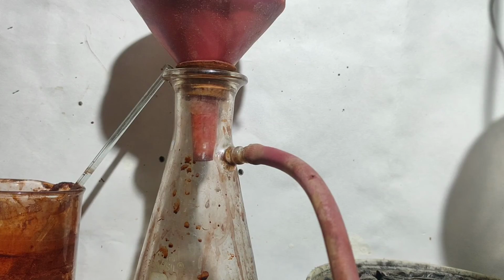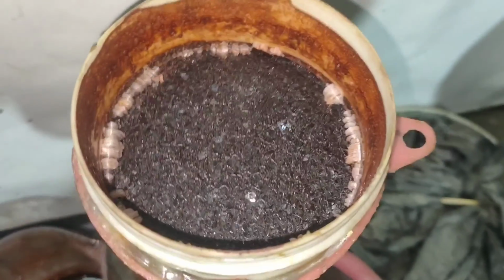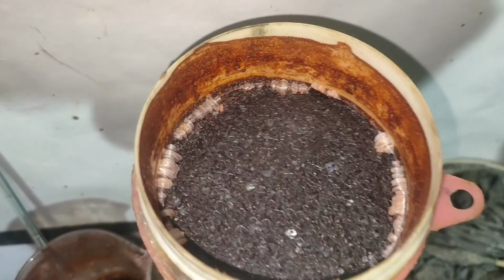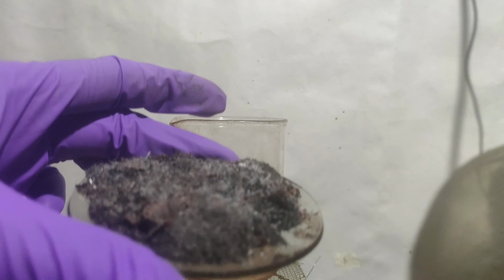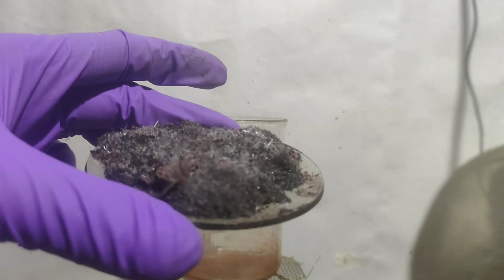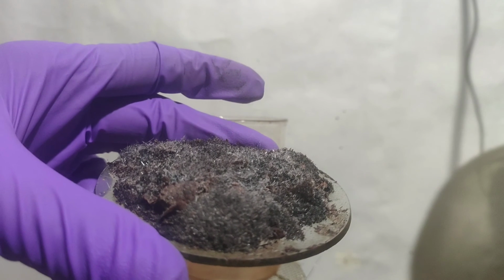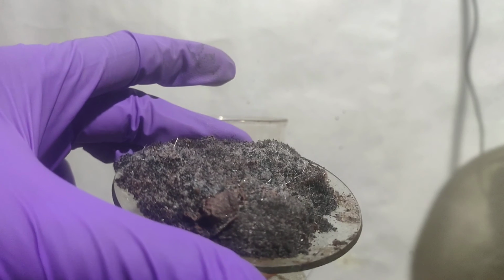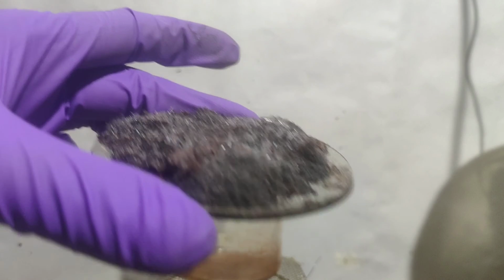The residue is Congo Red with a high impurity of sodium chloride. It can be further purified by dissolving the Congo Red in hot ethanol and evaporating the ethanol to dryness to recover pure Congo Red. But I had no ethanol left and the sodium chloride impurity wouldn't matter for me, so I dried it in a desiccator. It was highly impure, so I did not calculate its yield.